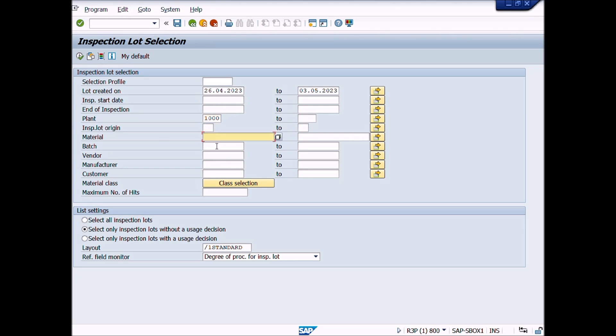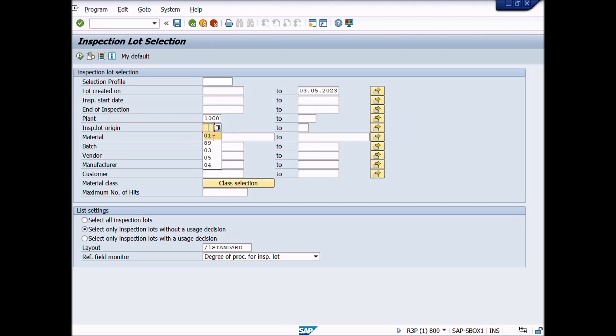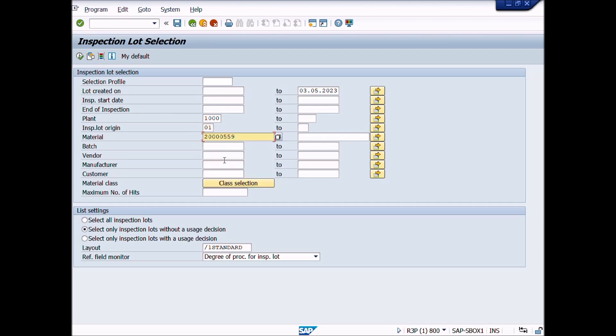You can search the materials lot by setting up your own criteria according to your requirement. Enter plant, enter inspection type, enter material number, enter batch number if needed.